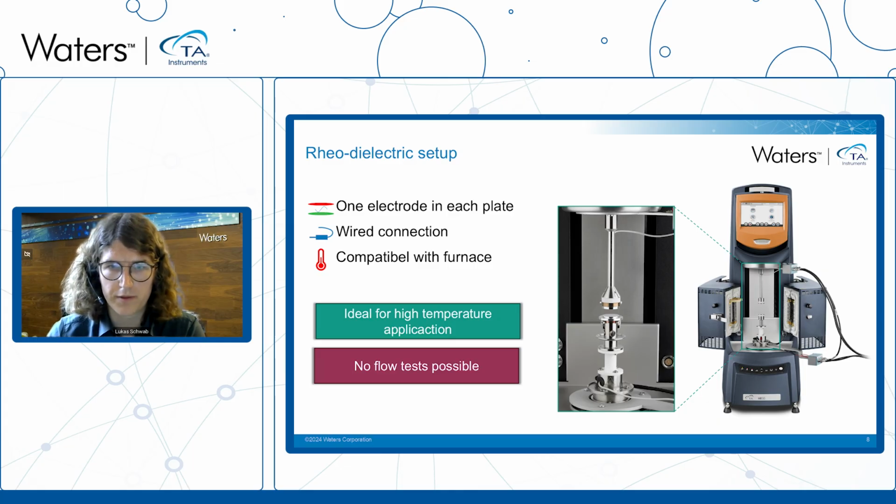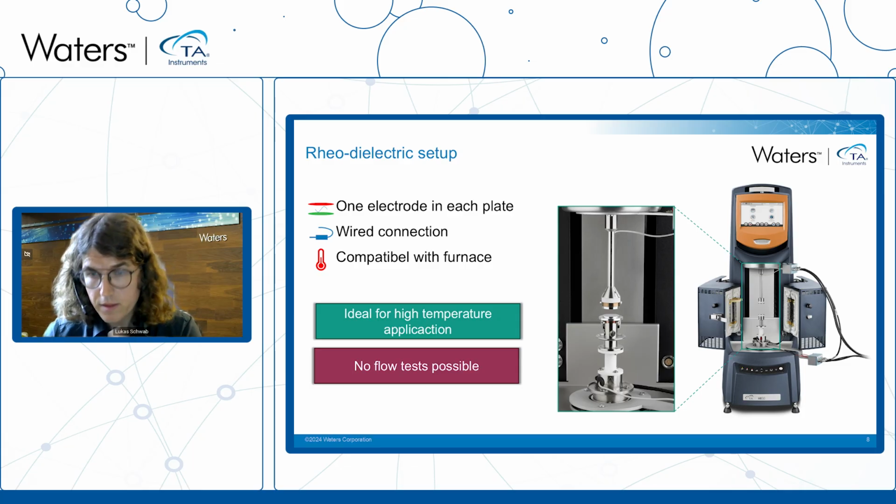So we need to come up with something different. And there are already other methods which either use liquid electrodes or spring connections between the top plate and the LCR meter.